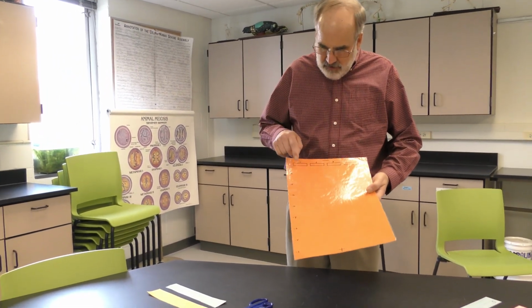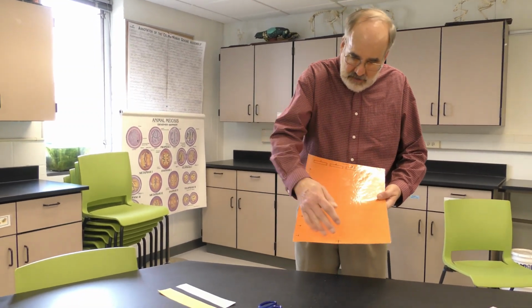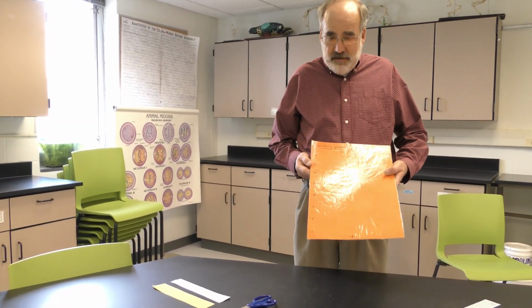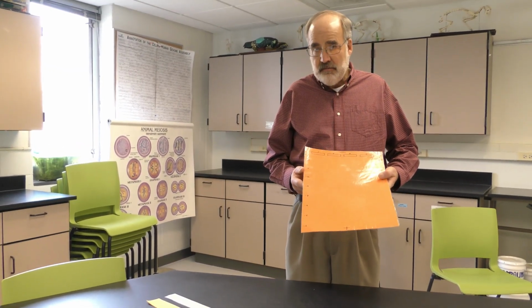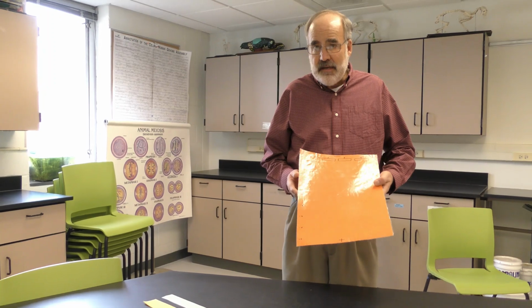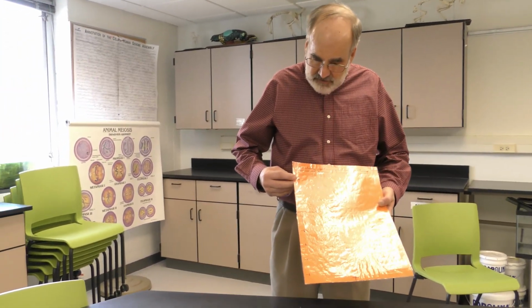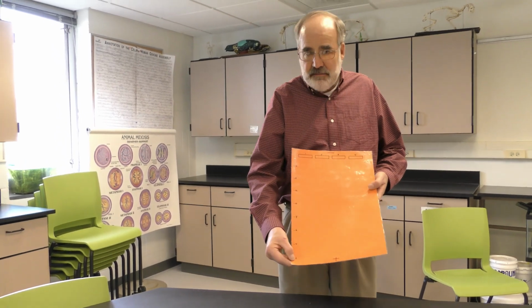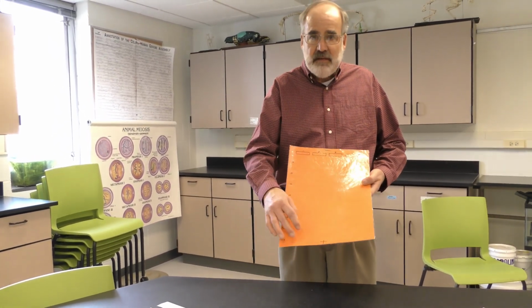When we load our DNA fragments on this gel, they would migrate in this direction according to their size. The scale over here represents the number of base pairs. Remember, we're working with double-stranded DNA, so we're talking about base pairs. This is 16 base pairs up here, down to 2 base pairs down here. Larger DNA fragments are up here, smaller DNA fragments down here.